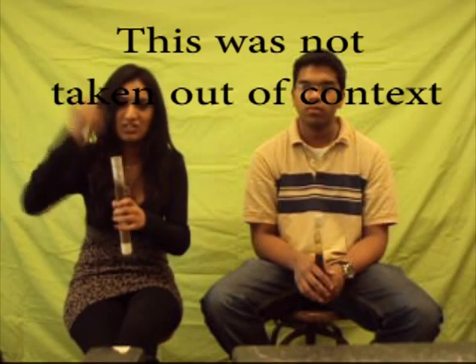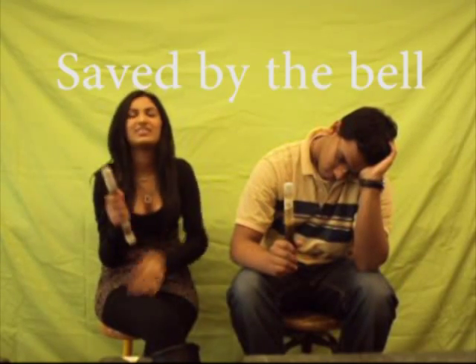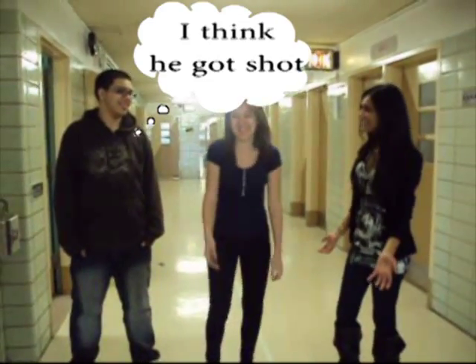Because Alvin doesn't know what he's doing. Oh, really, Deepa? Well, you know what? I got you with the bloopers. Come on, the first thing with the bloopers. Long rod to make sure that there's not that much air. Oh my god! And after 4 to 7 days, you have to take off the aluminum foil and you have to. Damn it! Guys, where's Alvin? Guys, maybe you should listen in class rather than talking.